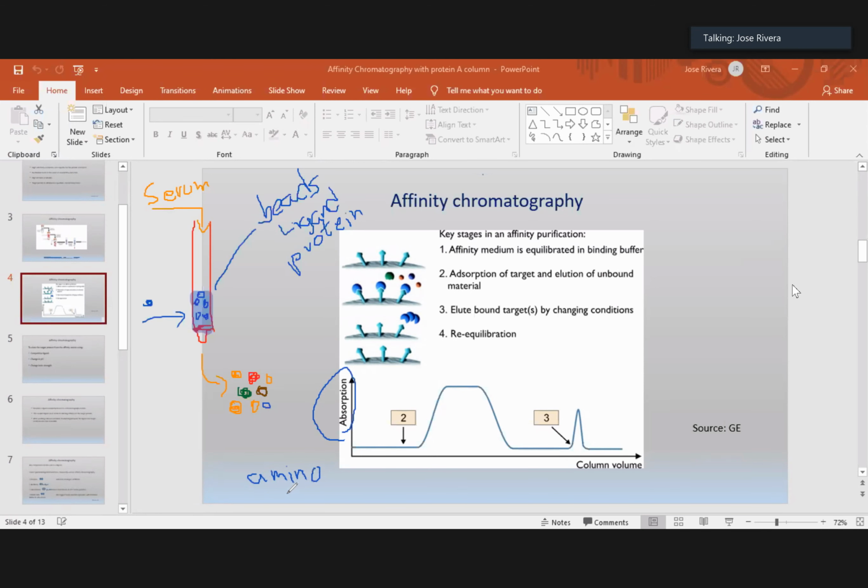Any protein that has these aromatic amino acids, at least one or two tyrosine, I think, they can measure the absorbance, and so you can track where the proteins are coming out. Because what you do is you have a column, and then you have different test tubes where you pick the different fractions.